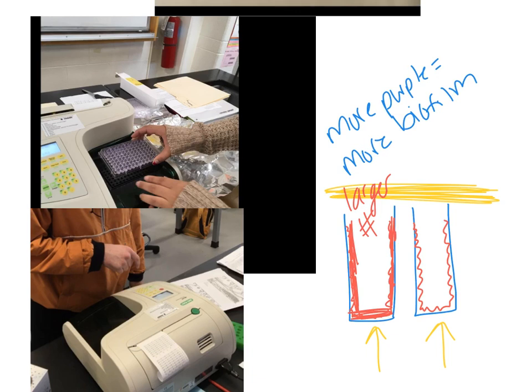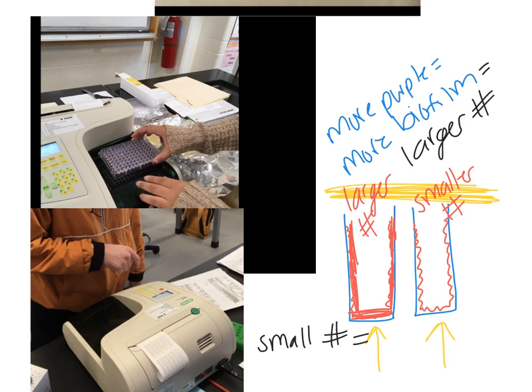On the right, I have less purple, less biofilm, so my light would more easily be able to pass through that sample, so I would get a smaller number on the plate reader. So what that means is that if there's more purple and more biofilm, you will get a larger number on the plate reader. A small number on the plate reader tells us that there is a small amount of biofilm.